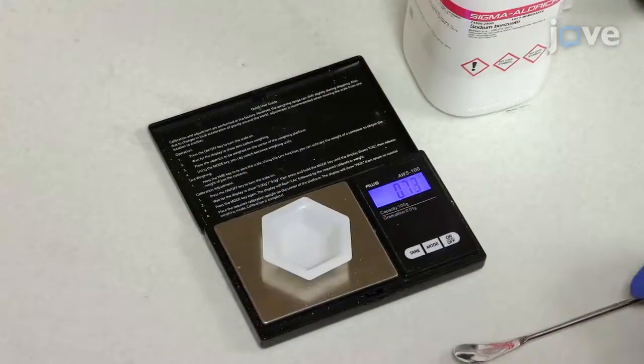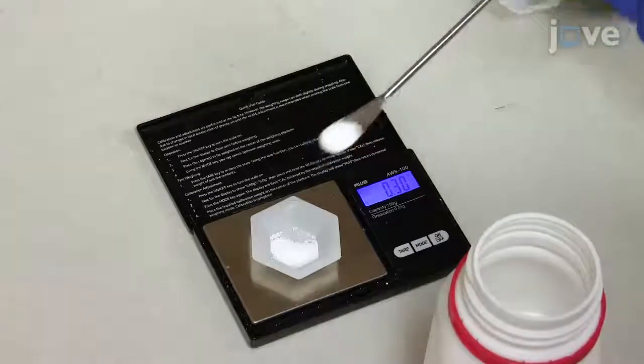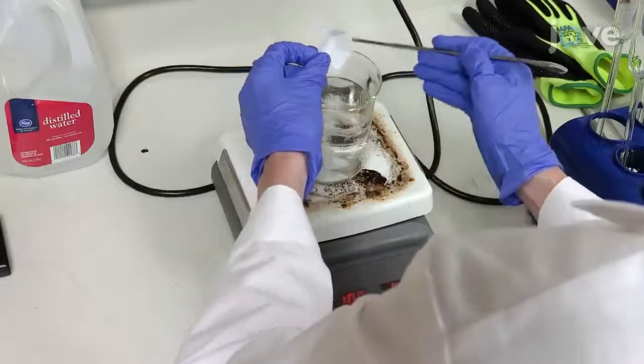Use a calibrated scale to measure 0.30 grams of sodium benzoate into a weigh boat. Add the sodium benzoate to the water solution.